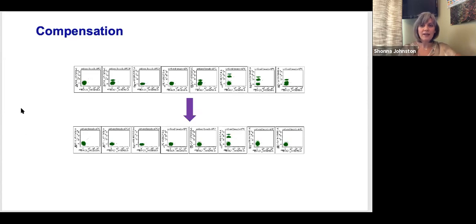By duplicating our beads all the time, we're allowing people to see how the automatic compensation or the spectral unmixing is actually working and how it's affecting the samples that we're running through. So if we take this sample here, these are APC beads that I've run through the instrument, and I was looking at them just against a few different fluorochromes, other channels. And you can see you're almost getting a very, very basic spectra across here. And then when you add on the compensation, you should only see populations coming in here and nothing coming in these other areas.